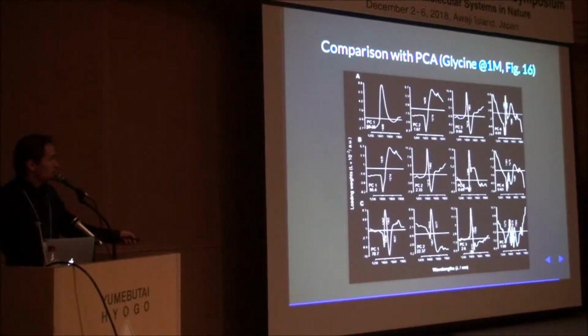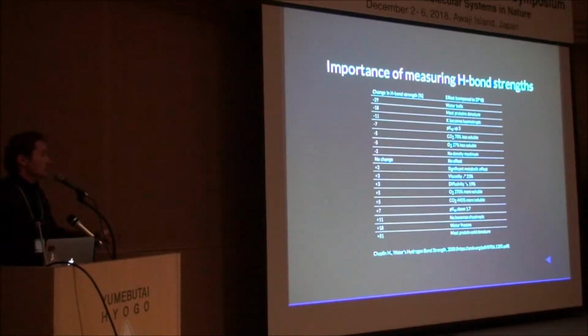And then your third jumps to 2.5. So these are still low, but they're almost 10 times, 20 times bigger than what you had before. So the distribution of variance changes. Your bands are filtered, your bands are visible now, and in the principal components you can think about what's happening here, and so you get extraction completely. This is where you were with raw spectra, in the fourth principal component with 0.01 variance, and you got that up to 70% in the first principal component. Okay, so that's basically the end.